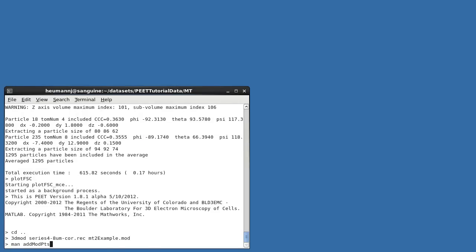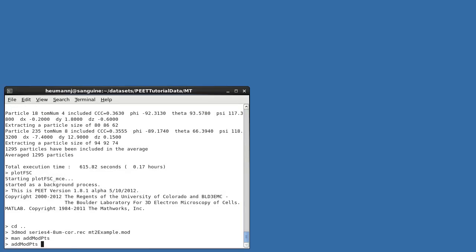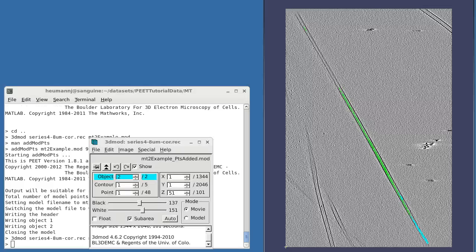As before, we'd really like points every 8 nanometers, and can accomplish this using addModPts, this time with a trailing -T option indicating a model designed for use with modTwist2EM. After running addModPts, additional points will have been added, as requested, maintaining the one-to-one correspondence between Objects 1 and 2 required by modTwist2EM.